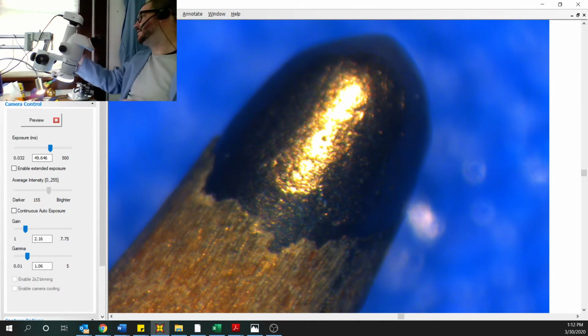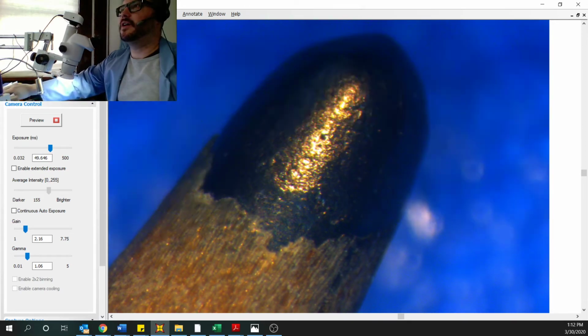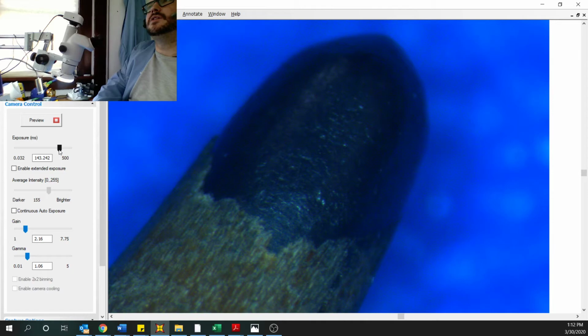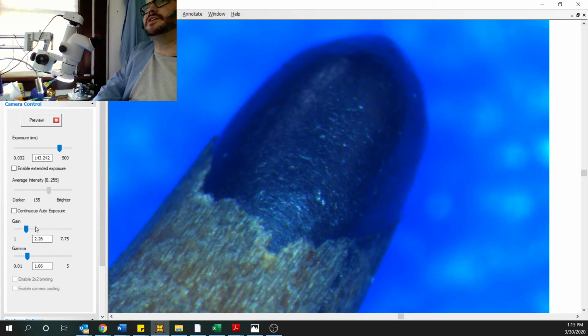That's pretty neat. Look at that. Now we'll make a little bit more focus there. Let me try turning the light off and then increasing my software settings slightly. Let's go up just a little bit higher there. Whoa. Look at that. There's all kinds of cool little things on there.